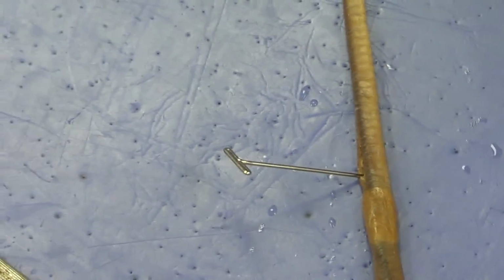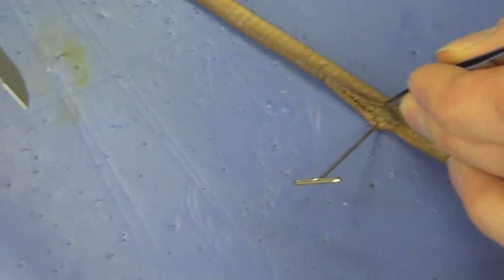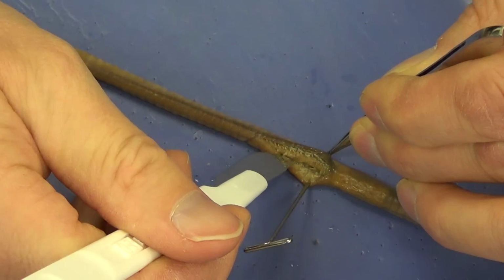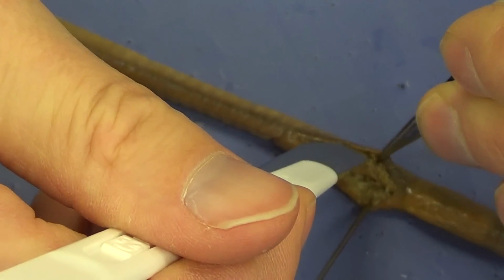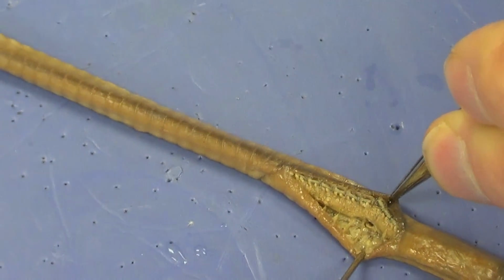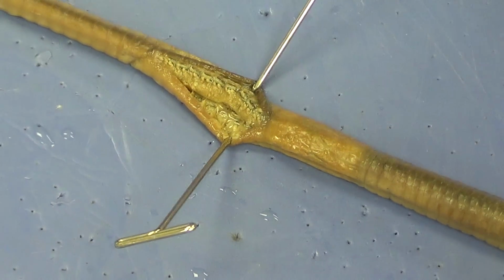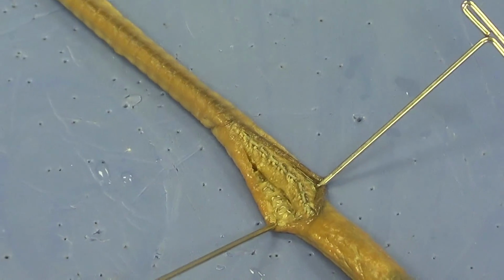So I've pinned one side of the skin, and I'm going to turn the earthworm just a little bit, and I'm going to pull that skin back. I'm going to sort of tent it up. And you can see the septa start to appear. And I'm going to cut those septa because that's going to release the skin. And I'm going to be very careful to not cut the intestine. If you cut the intestine, you're going to see some black material ooze out, and that is simply topsoil. That's all it is. That's a signal or an indication that you have cut too deep. That's about half an inch or so.